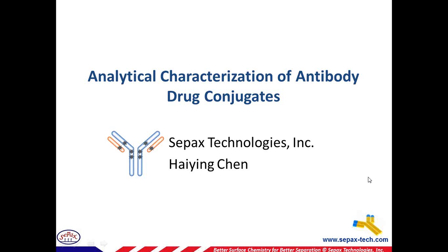In today's webinar, I would like to discuss the analytical characterization of antibody drug conjugates. We'll be talking about some of the challenges and the solutions. Even though we're talking about analytical solutions for antibody drug conjugates, all the column phases we talk about today can be scaled up to the semi-prep and the prep scale with either larger column volume packing or with larger particle size for your semi-prep or prep scale, depending on the purpose of your separation.